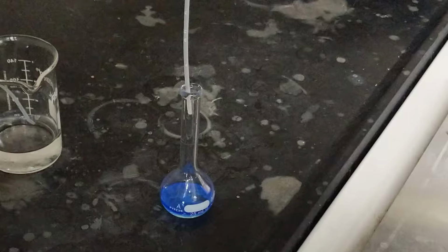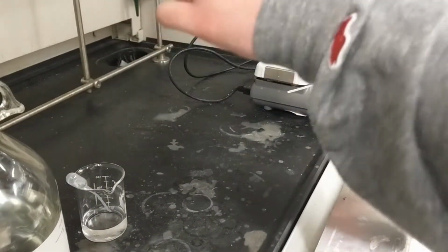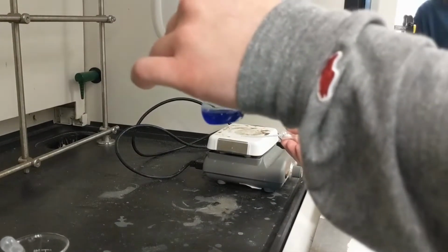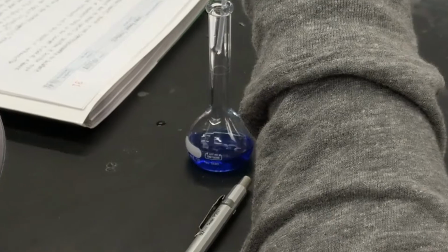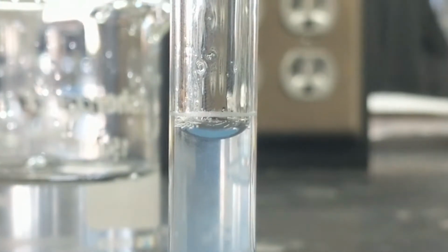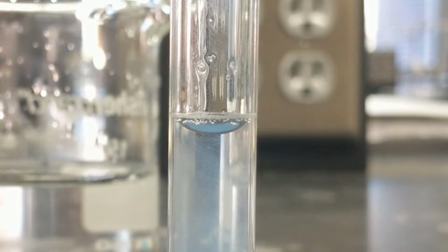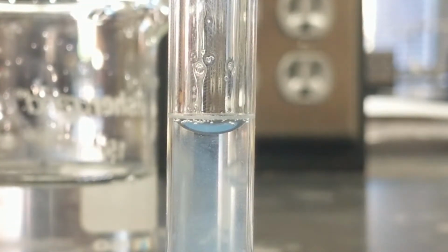Once your solution has a dark solid blue color, move over to the fume hood and add ammonia. You will not need any more than 5 milliliters. Return to your lab station and dilute your solution with water in a 25 milliliter volumetric flask. Be sure that the meniscus does not go over the 25 milliliter mark, or you'll have to start over. If at any point the solution starts to become cloudy, add a little bit more ammonia until it stops.